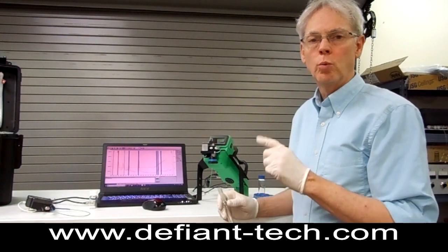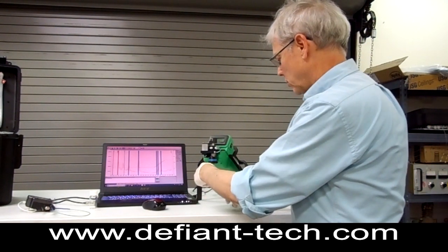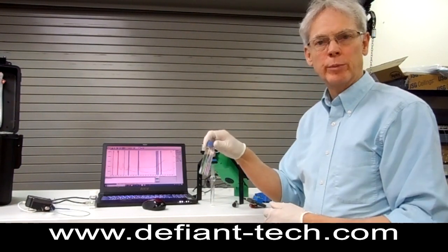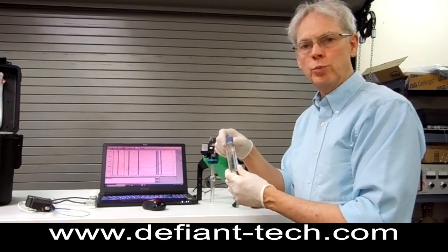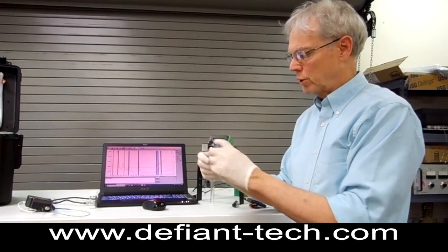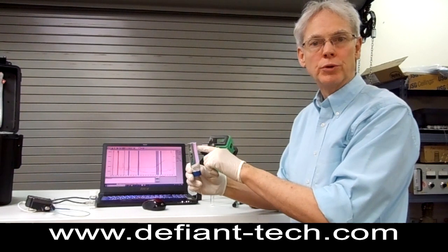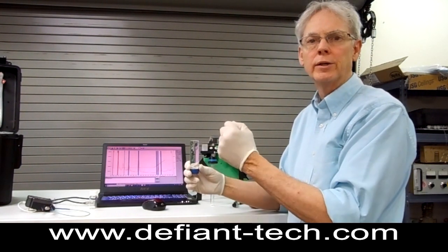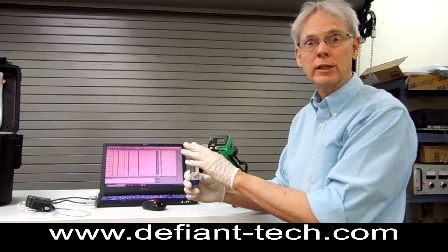But today we're going to do a demo on water samples. What I have here is some slightly contaminated water, and you'll typically be getting a sample in this type of vial. You may want to turn it upside down and see there's no bubbles in it, because if there's a bubble in there, all the VOCs — volatile organic compounds — are going to want to collect up in that bubble.